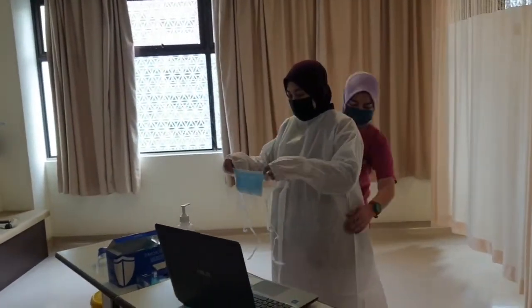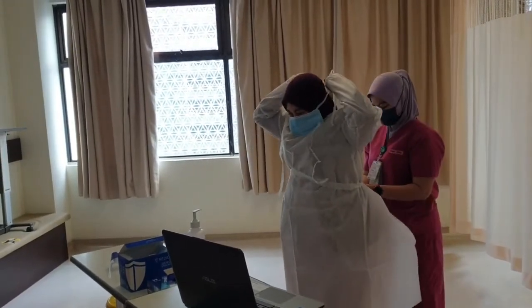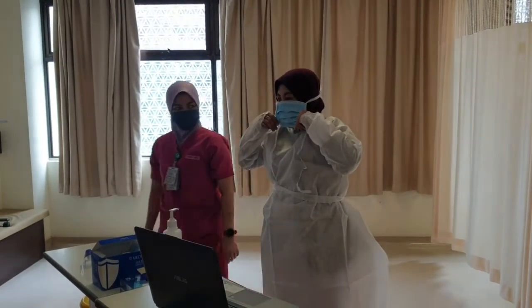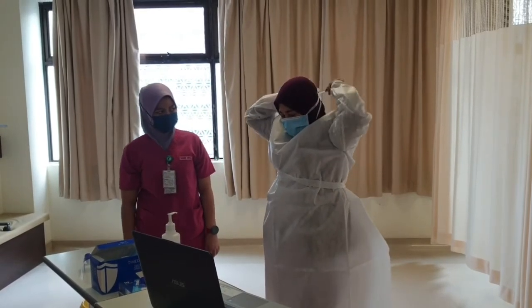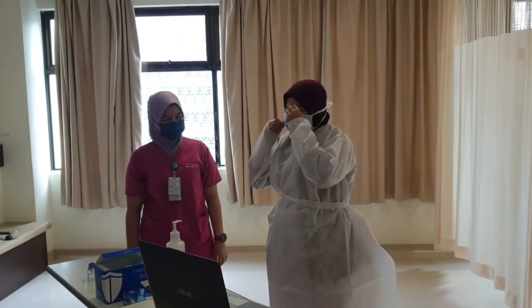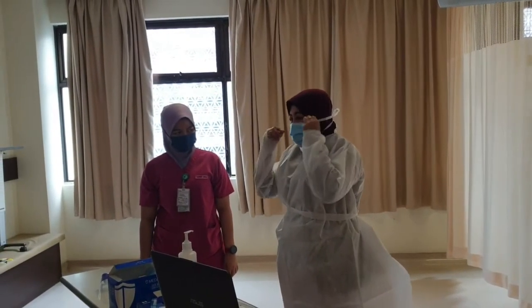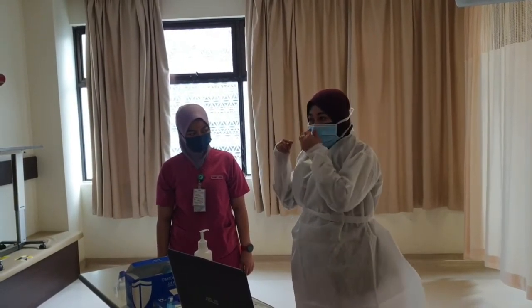Make sure you tie behind. When you wear your mask, you need to tighten the tie properly, and make sure the metal is pinched, and the mask covers all your face and chin.